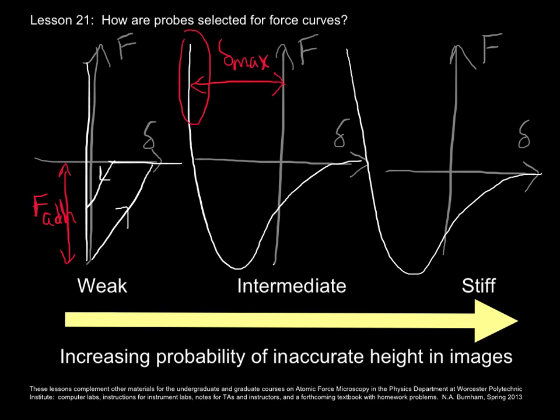And finally, if you want to start probing the bulk of the material, you need a very stiff cantilever such that up in the net repulsive part of the force curve, you still are getting some shape, some non-infinite slope there. One wishes that cantilevers could be all things, meaning that you could use it to get good images and also good force curves, but that's one of the main dilemmas of AFM: what you gain on one hand is usually what you lose on the other.